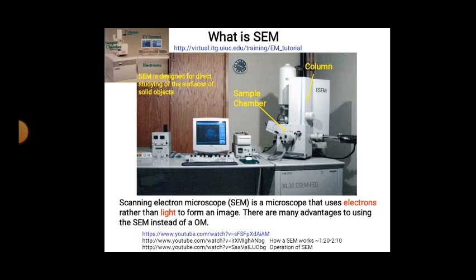In a scanning electron microscope, because of the high accelerating voltage and electron density, the electron beam penetrates the sample surface to a depth of a few microns. A number of electron signals are produced when electrons interact with the surface of the specimen, depending on the depth of penetration.